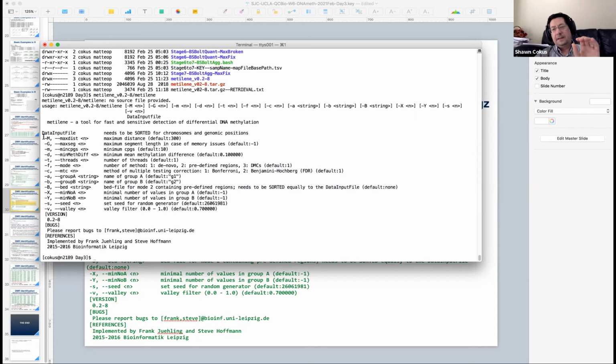And then, the literal region on the genome that actually is differential, suppose it's very, very clean. Suppose it's completely CG methylated out here. There's a very sharp boundary where some of the samples just stay completely CG methylated across there, and the other group, the samples just go to 0%. It's an easy one. So in IGV, it's solid red, solid blue, solid red, and solid red all the way across, in group A and group B.